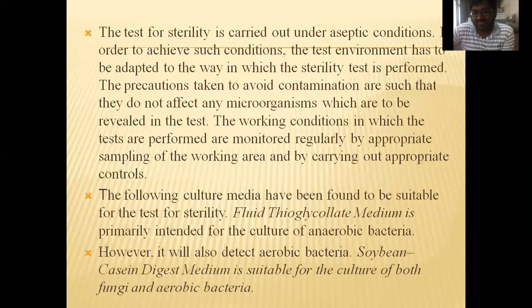So what exactly is sterility testing? The test for sterility is carried out under aseptic conditions. In order to achieve such conditions, the test environment has to be adapted to the way in which the sterility test is performed.